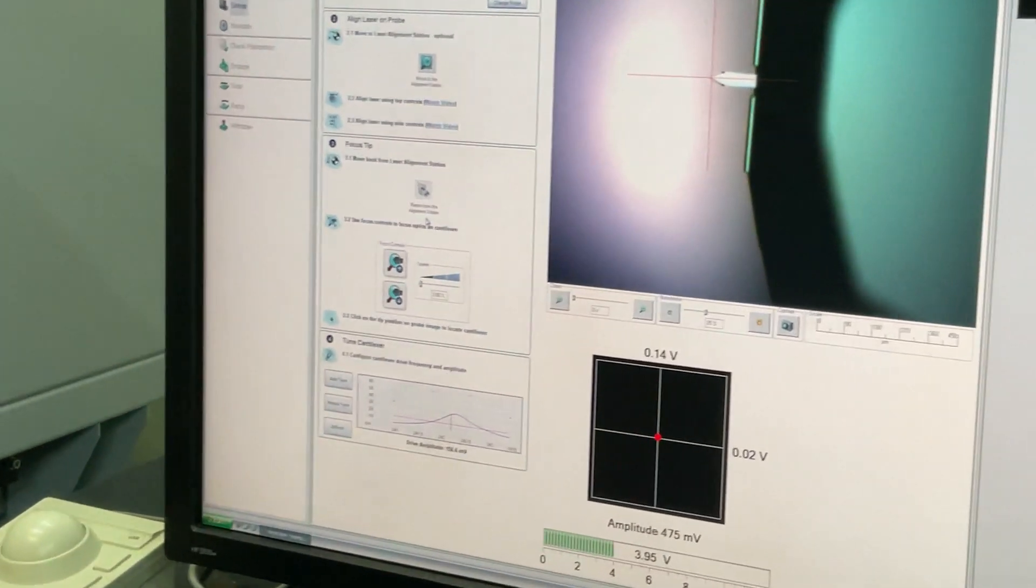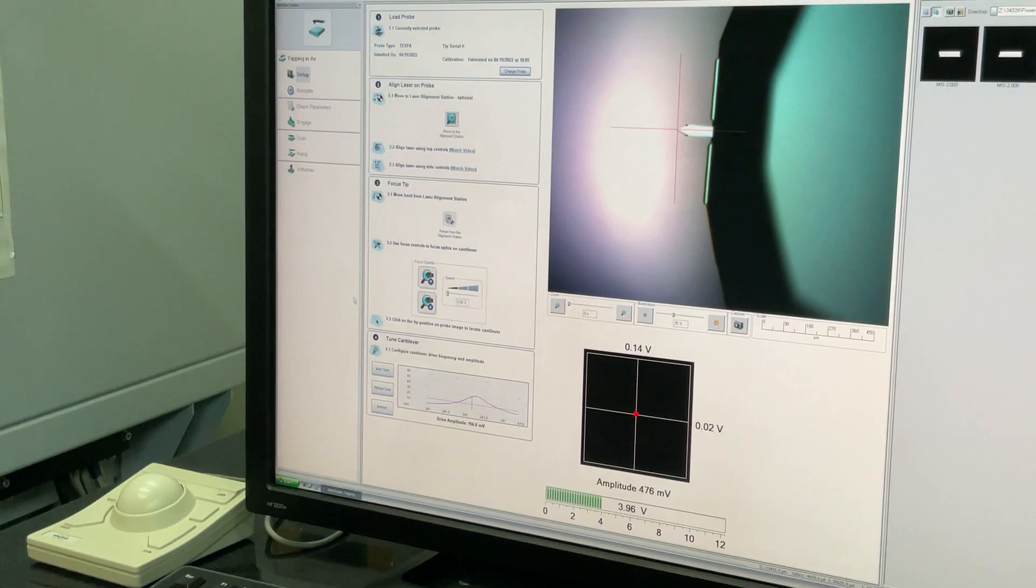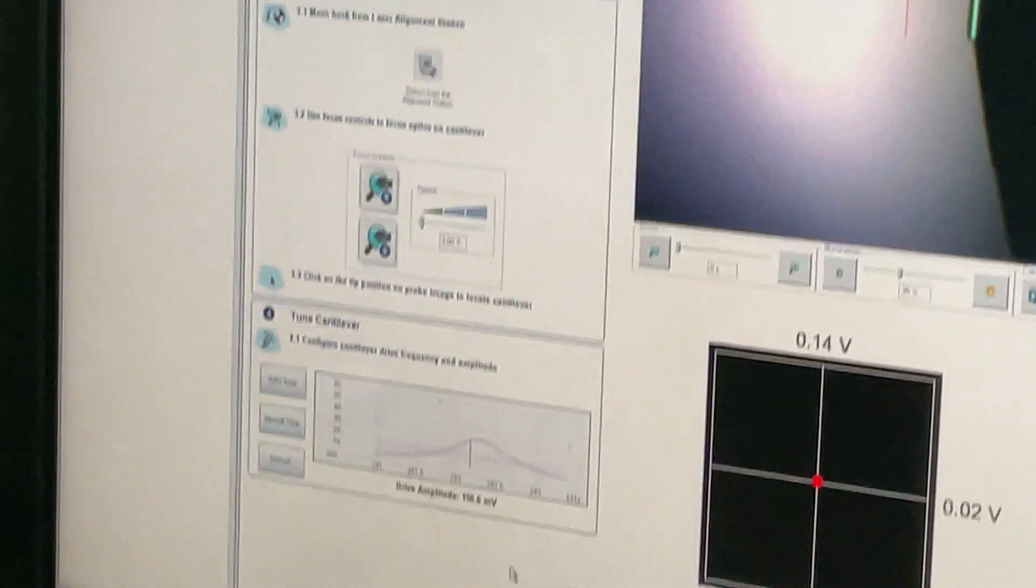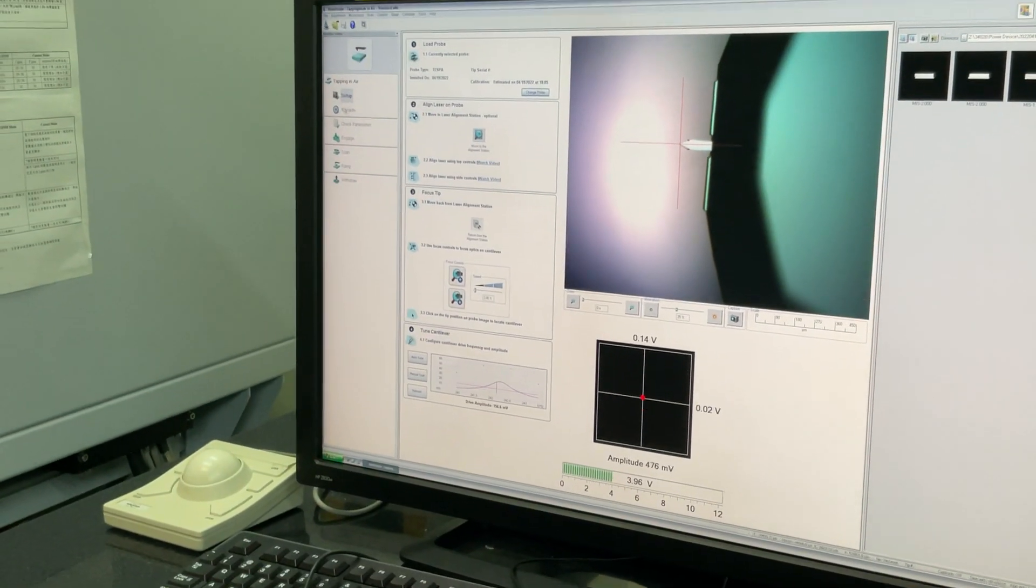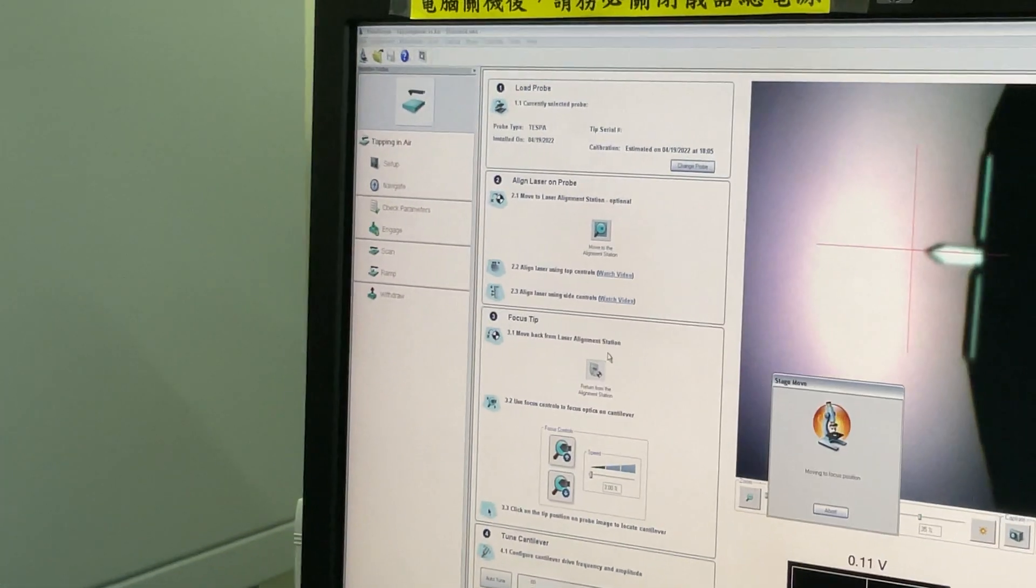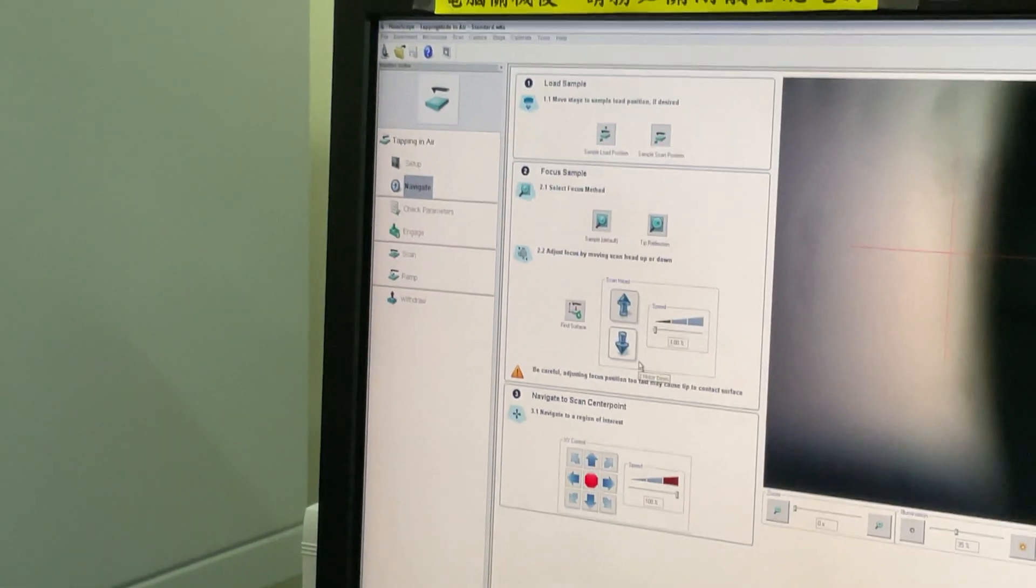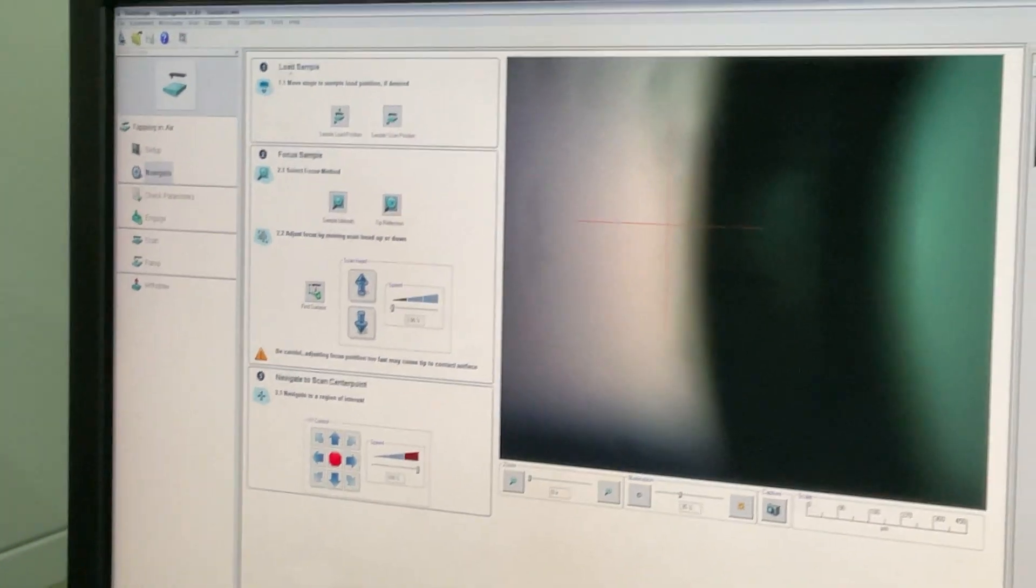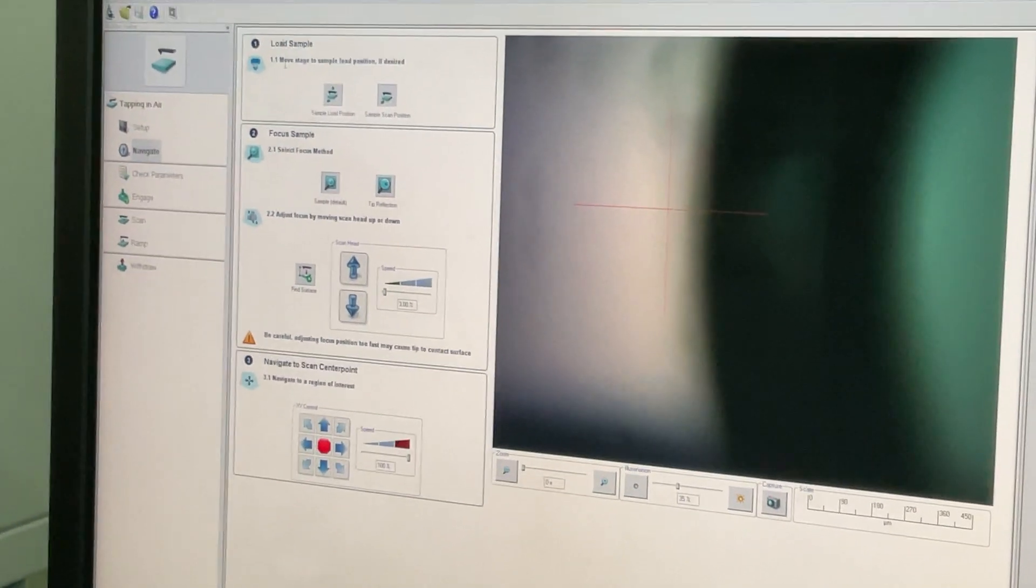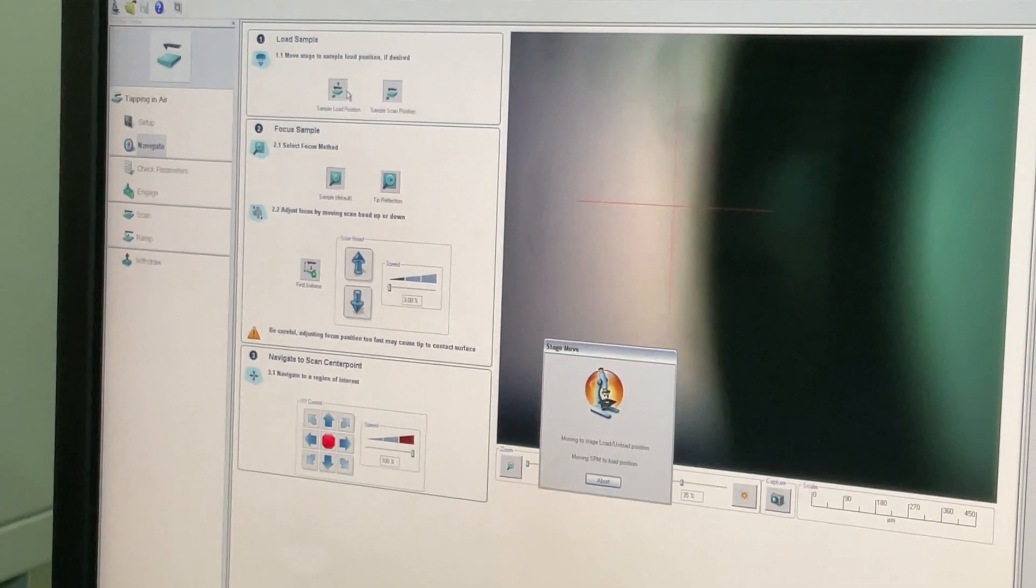If there is not any window, this domain is open. And then we can put our sample, so we use our name and click this one, load sample. Now we want to load our sample, so we click this sample load position.